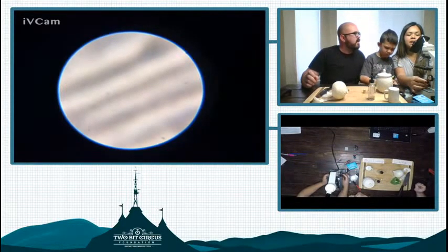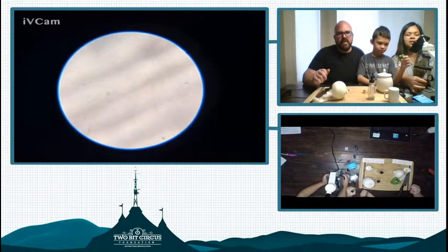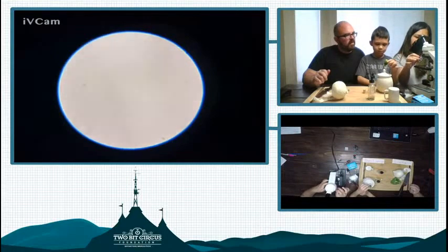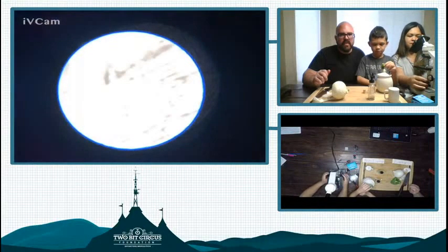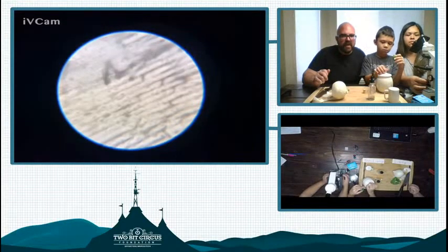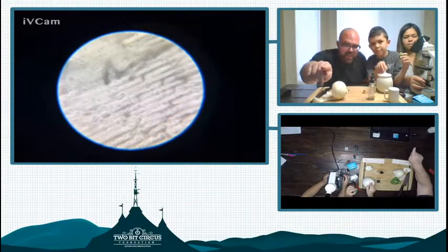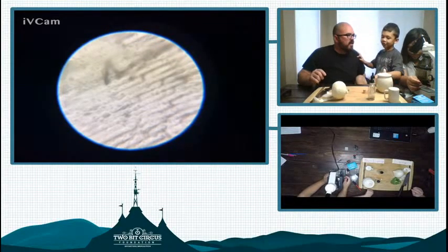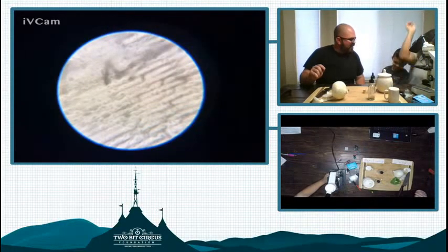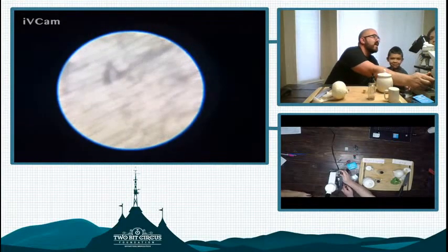Normally in class we use iodine and we dye the cell wall so we can see it clear. And you can kind of see those ridges there. That's the cell wall. I'm gonna flip it over to a lower power. There, and you can see a lot of them here. Yes. You see that, Robert? Look at that shape. You see all those cool shapes in there? They're all elongated. Like my shoes, how they look on the bottom. He has honeycomb structures on the bottom of his shoes that kind of look like cells, huh?